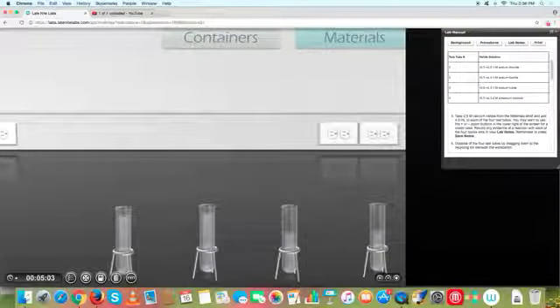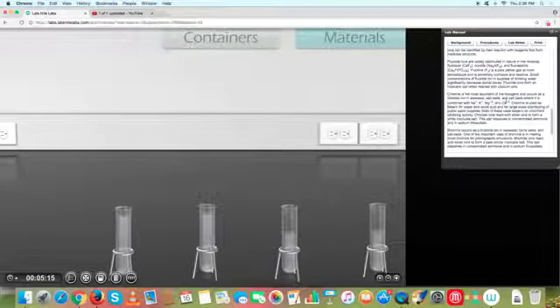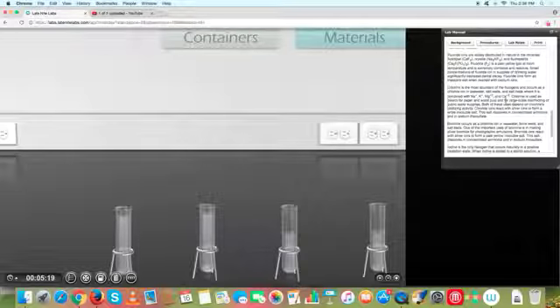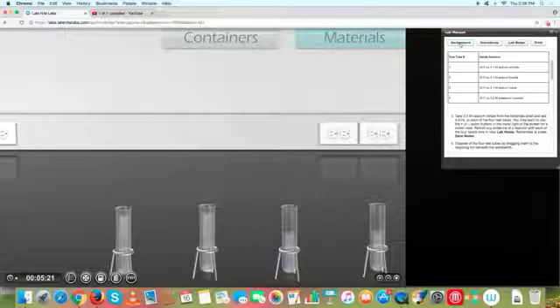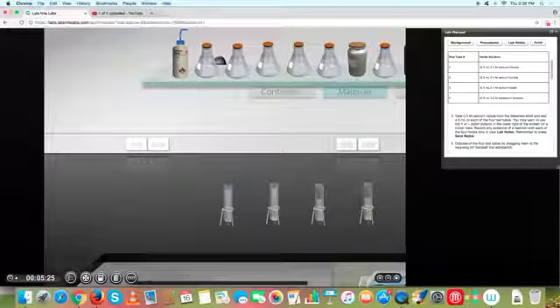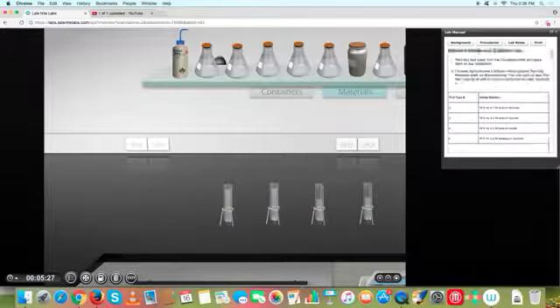Now I can do the same thing to these, and you can see what result you're going to get from those as well. But this gives a good piece of information for us. What you can do is go back to the background and see what was expected to have a reaction with calcium ions. After you've done all this, you can exit the lab once you've completed the procedure.